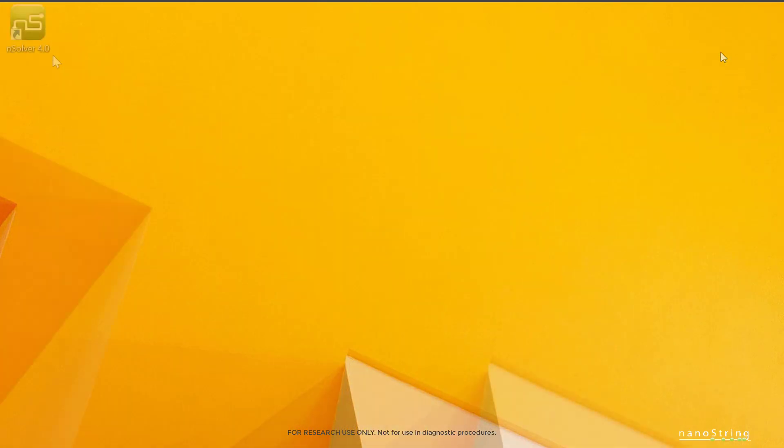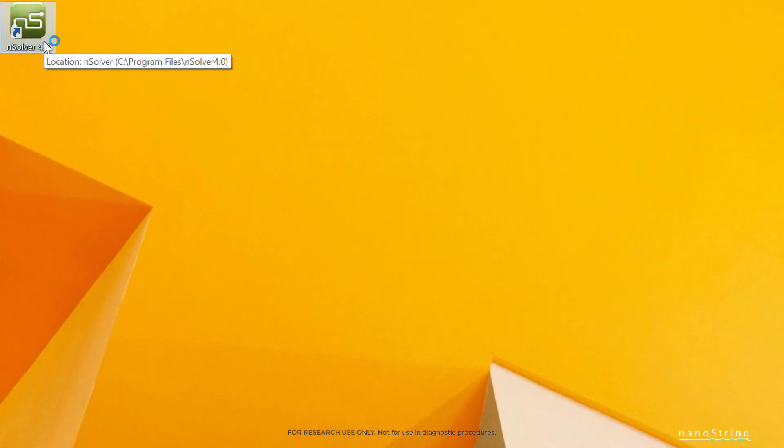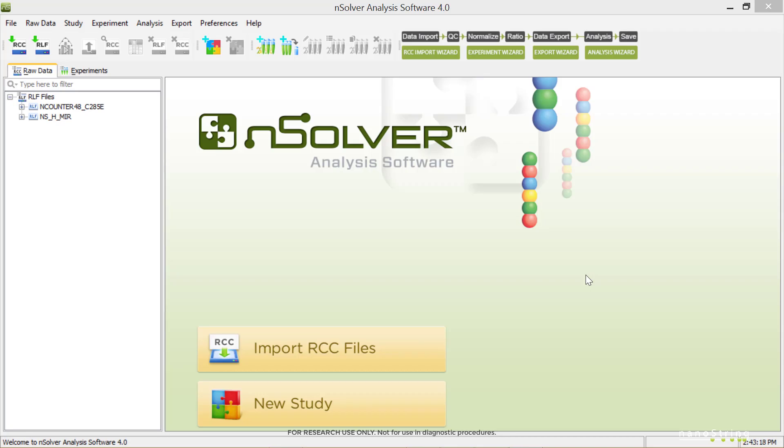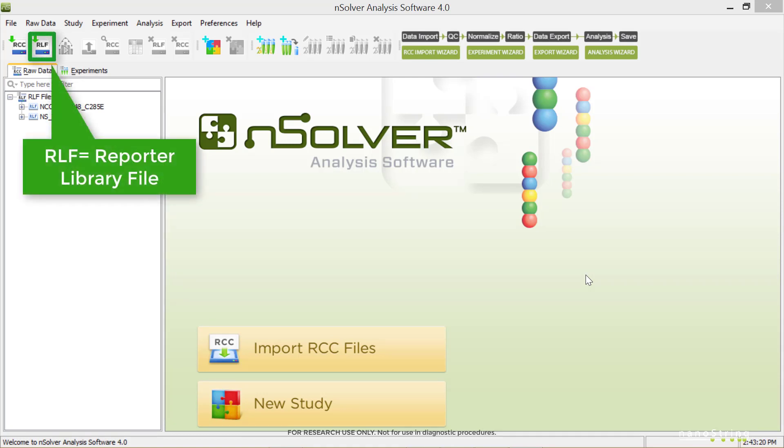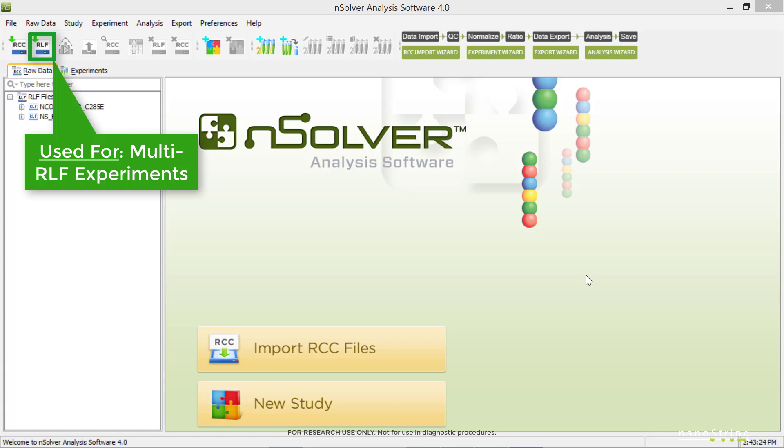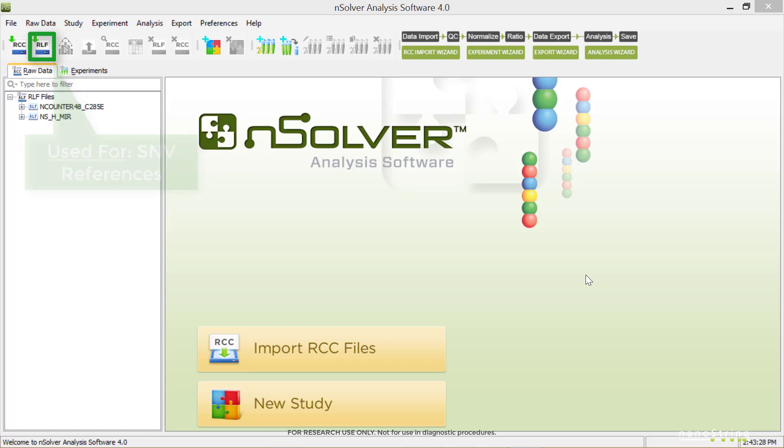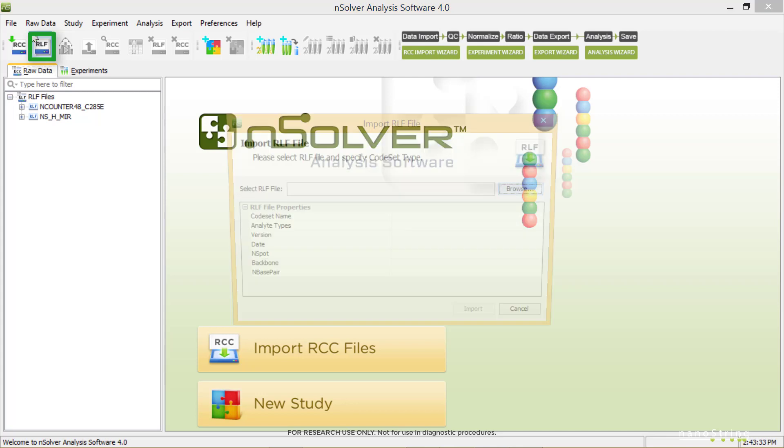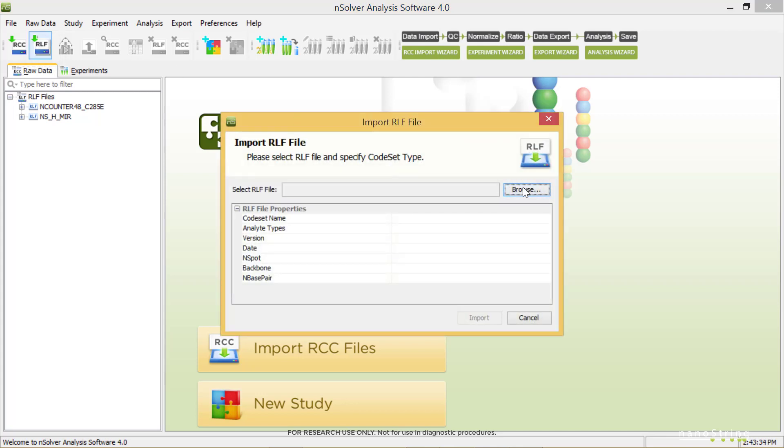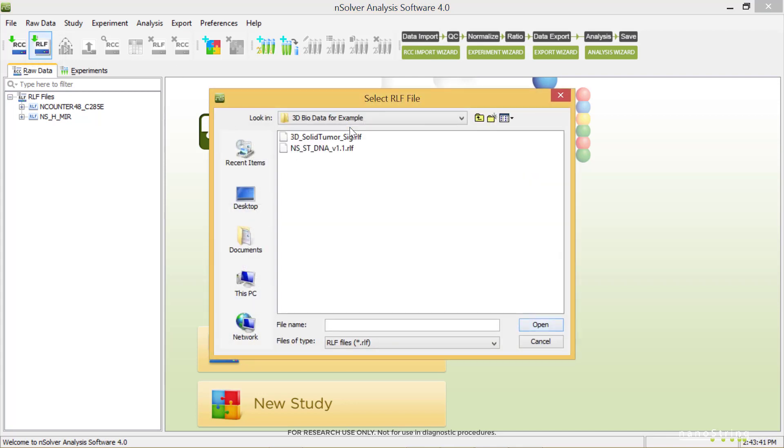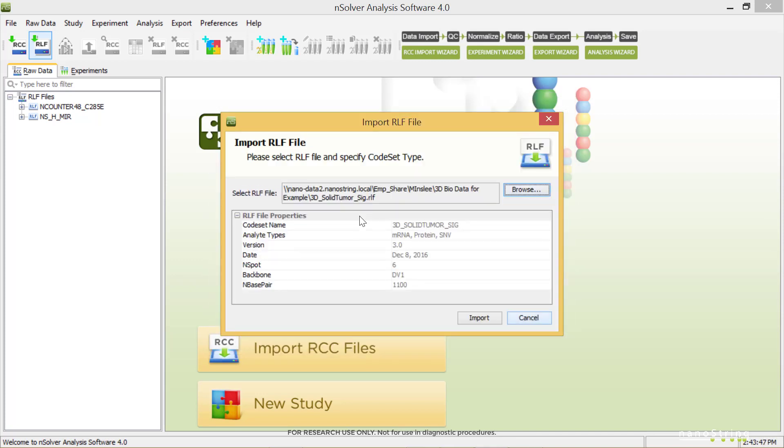Now we'll open NSOLVER. Let's start with the RLF import. You'll need an RLF if you plan on using the Advanced Analysis plugin, running a multi-RLF experiment, or using any of the samples as SMV references. Select Import RLF. Browse to navigate to the folder with your unzipped data. Highlight your RLF and select Open, then Import.